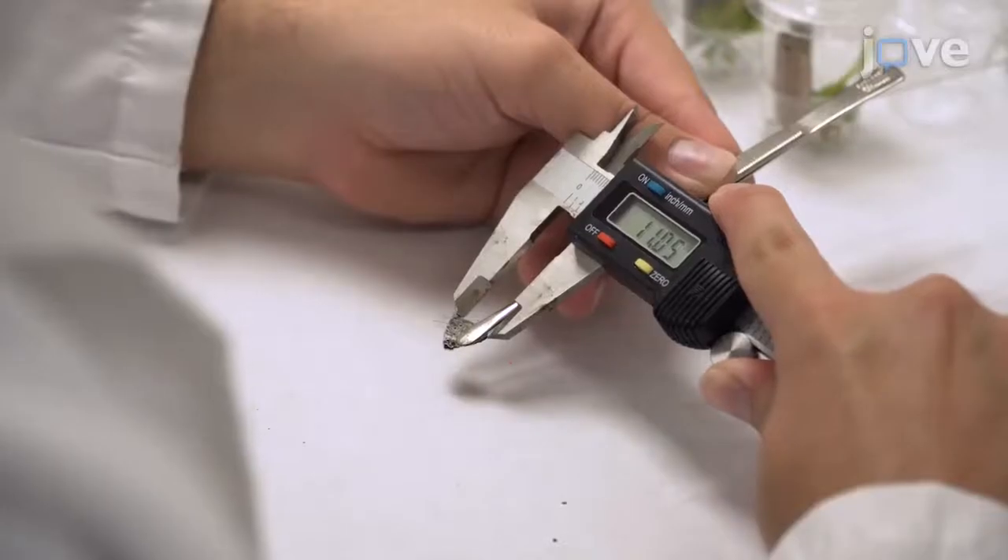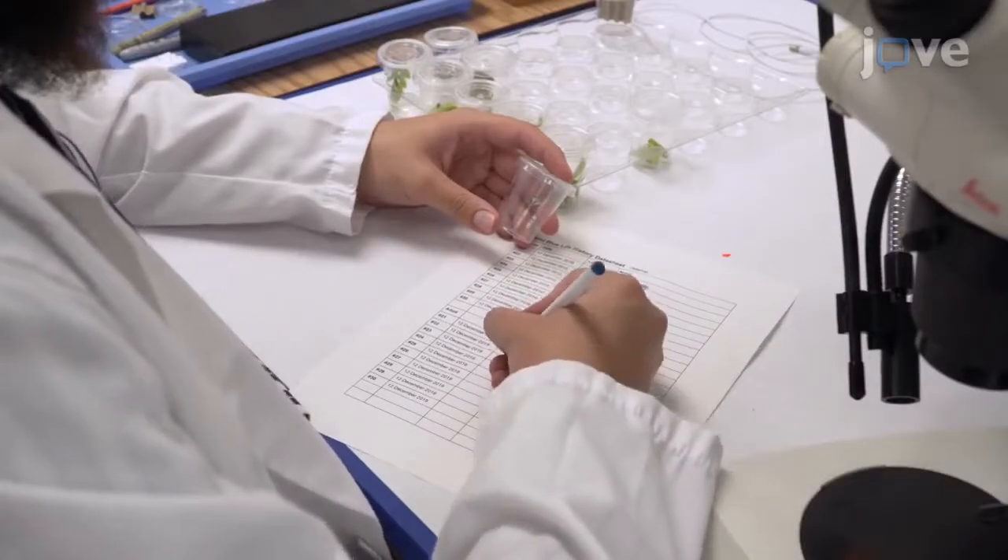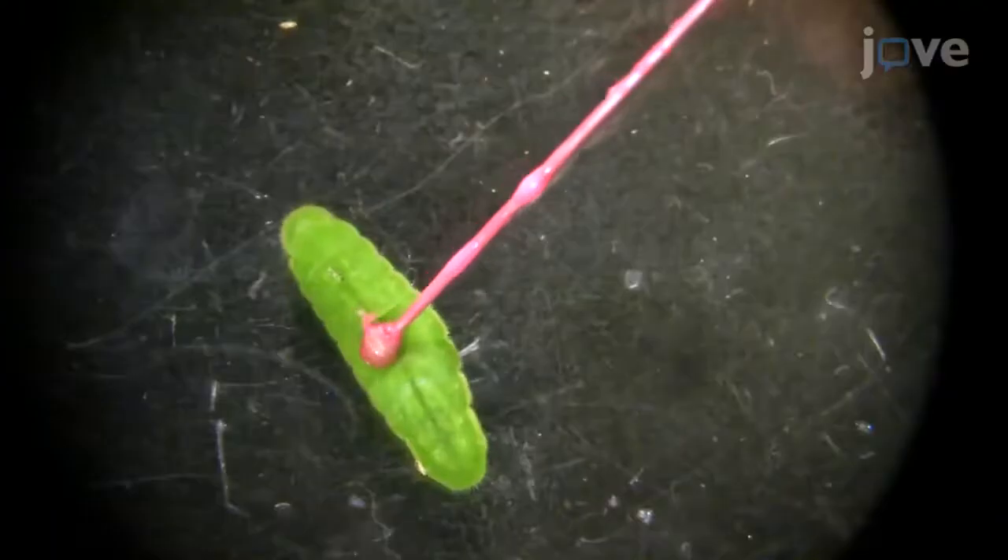This technique is an effective approach for documenting the life history metrics of an endangered butterfly, such as number of larval instars, duration of developmental stages, and size of all life stages. We have streamlined our protocol so that productivity and efficiency may be increased in the laboratory, which is especially important when collecting data in a short time frame.